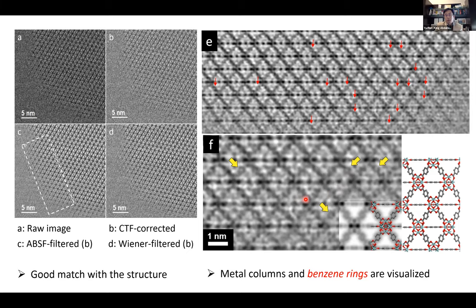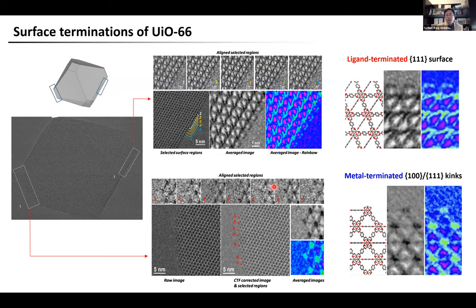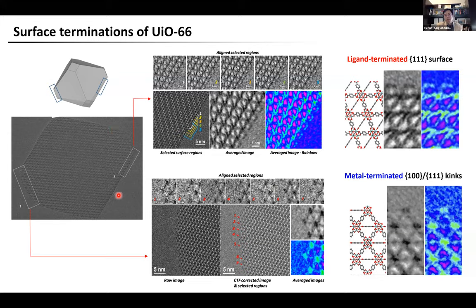This result confirms that the crystal structure of UiO-66 is very well preserved under the ultra-low-dose condition used. After confirming safe imaging conditions from the bulk structure, we moved on to study the local structures. We observed that the surface termination of UiO-66 is facet-dependent. On the major 1,1,1 surface, we found the surface is terminated by organic linkers. On the truncated surface consisting of 1,0,0 and 1,1,1 kink positions, it is terminated by metal clusters. So two different surface termination modes coexist in a single crystal.